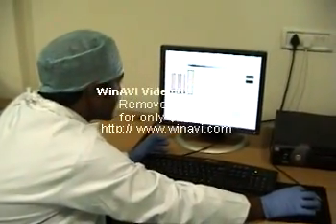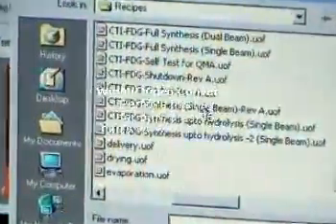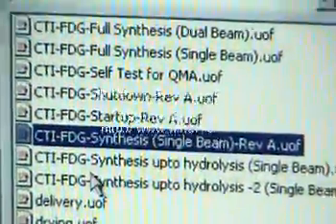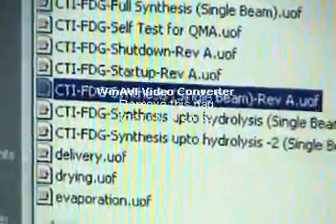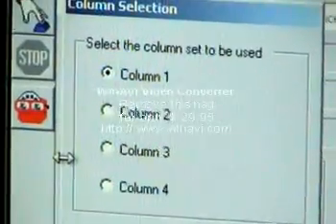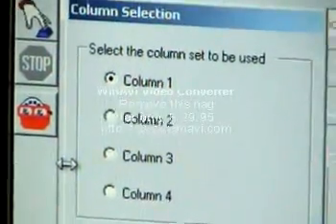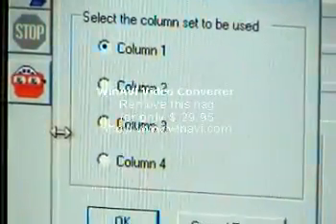If you want to start the synthesis, just go here. We have a protocol called 'CTI FDG Synthesis Single Beam.' Just open that. We select the QMA column — as already explained, there are four QMAs and you have to select one out of four. Today we are using QMA column four, so just click on column four.